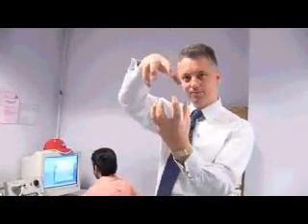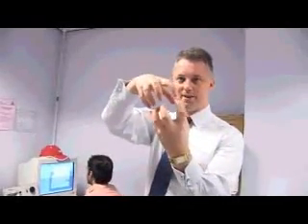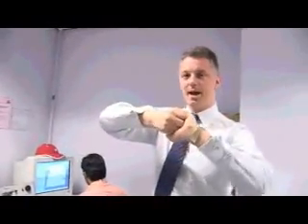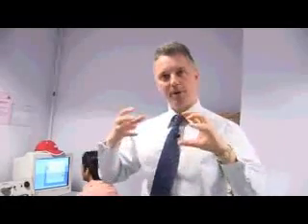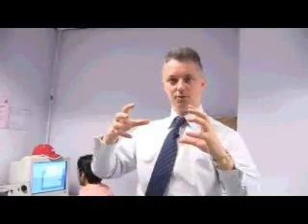This is a slightly different experiment where, when I was saying we can measure the forces between molecules, that's what Mudasir is doing here. So what we do now is we bring two molecules together. So this is nanotechnology at its best. We're taking two molecules, we're bringing them together, we allow them to bind, just as would happen in our bodies, the sort of biological process, and then we pull them apart. In this case it's a vitamin and a protein, and as we pull those apart we can understand more about the structures of the things as they bind. And that's one of the big questions in biology at the moment, trying to understand how molecules recognise and bind each other, and how the structure of those molecules helps us understand that.